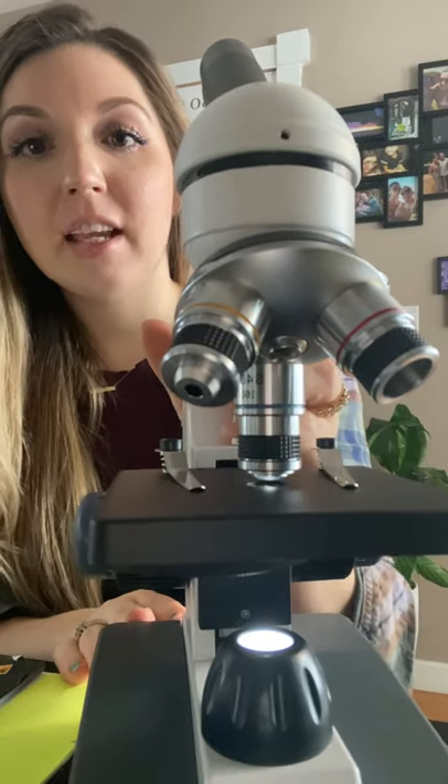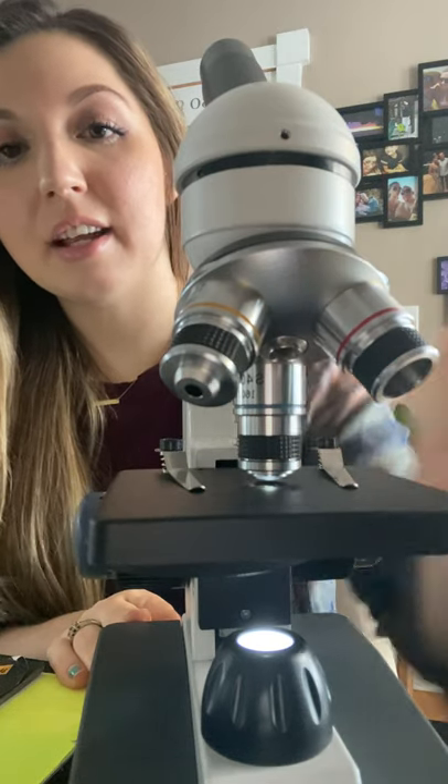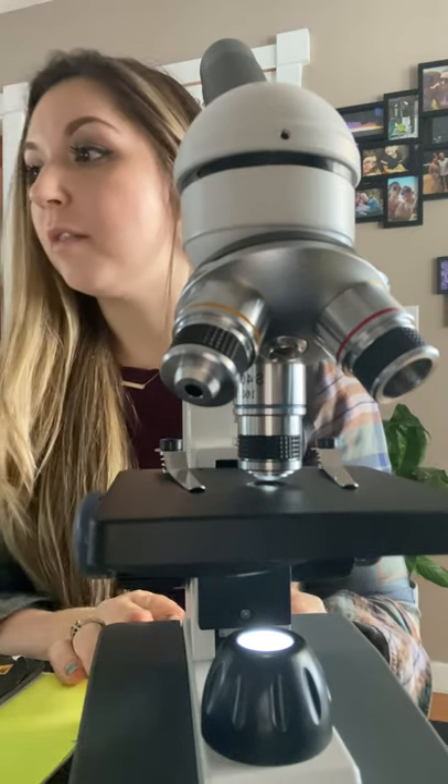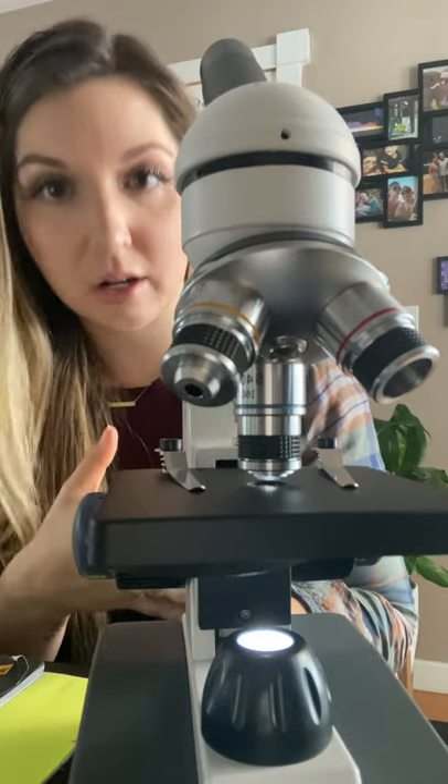Next we have the objective lenses. These three are the objective lenses right here. We have 40 times magnification, 100 times, and 400 times.